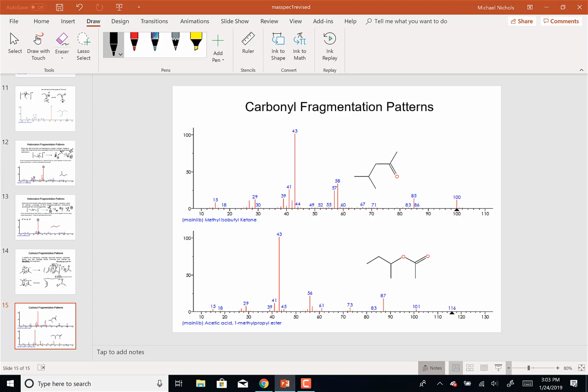So if I wanted to know what the 87 peak is, I'd love to have a mass spectrum of that. Well, on an instrument like we have, we can do it. I can tell the computer, I want 87. And then I can destroy 87 and look at its fragments, and see whether this piece fragments into these pieces. In drug testing, it's all done by using authentic samples. So that's called tandem mass spectrometry.